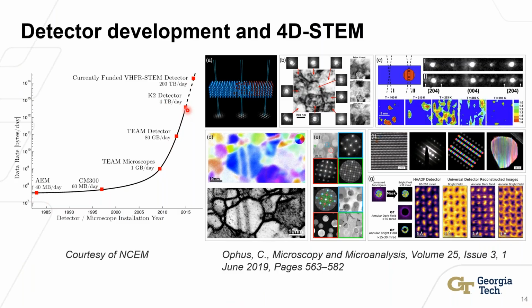So with that detector technology advance, you also see advances in the algorithms used to analyze images in the TEM. Probably the most famous and widespread these days is 4D STEM technologies, really driven and moved forward by Colin Ophus. Where in this approach, you raster the electron beam, similar to what we showed previously, across your sample and collect thousands or even millions of these diffraction patterns.